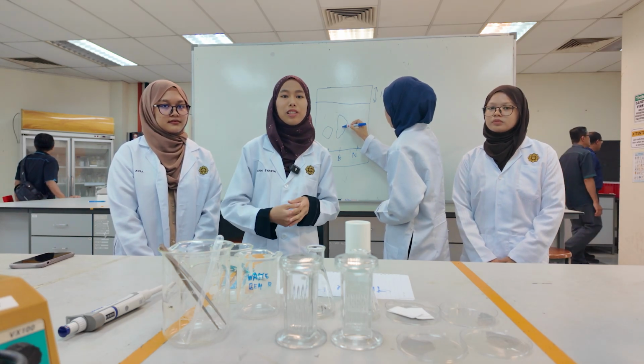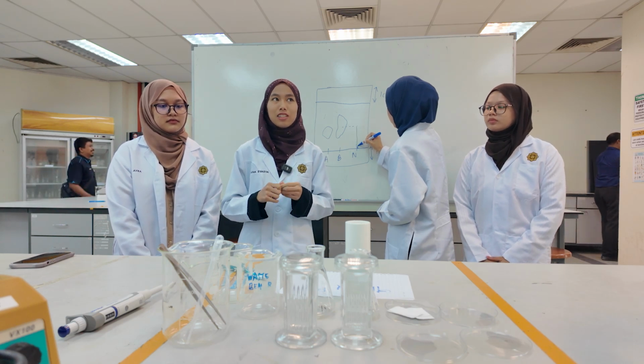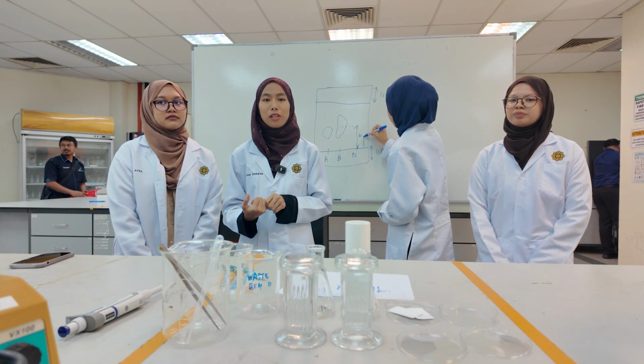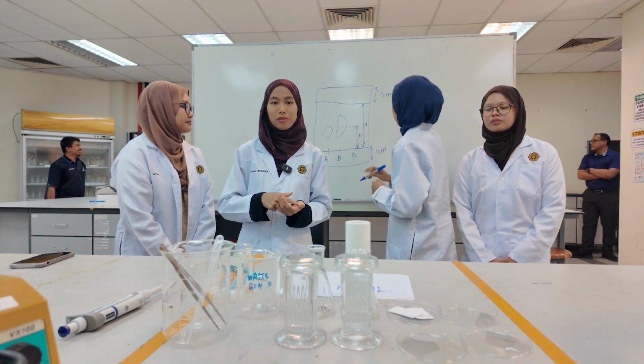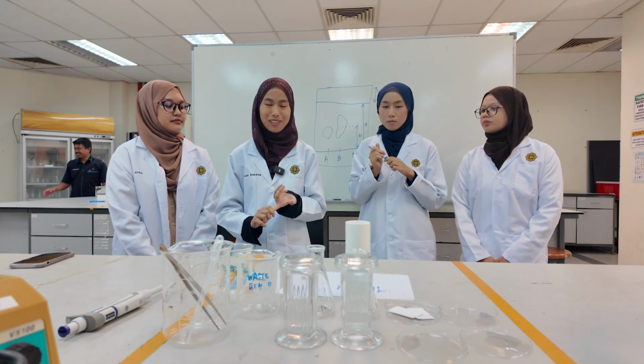In this experiment, the stationary phase is the thin layer of silica gel on a TLC plate, and the mobile phase is the liquid solvent that moves up the plate by capillary action.